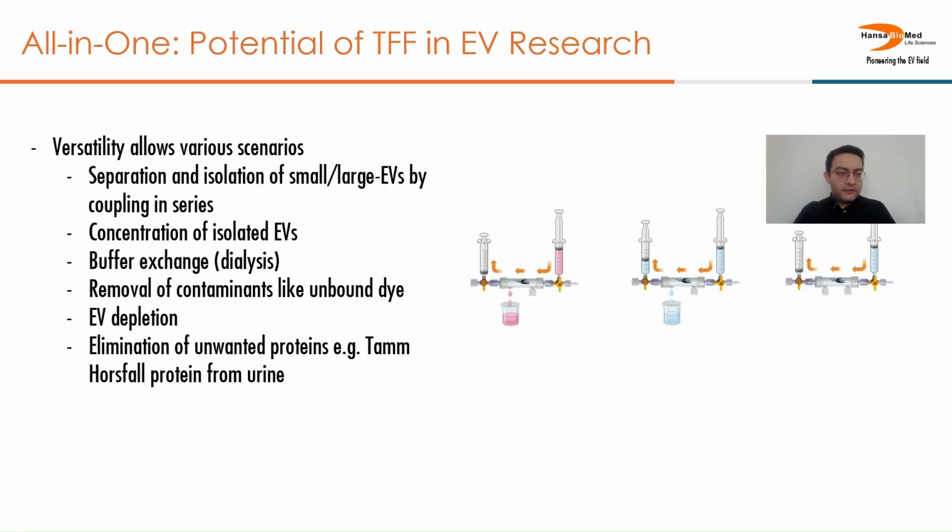But of course, the comparison is not only with the gold standard, because researchers have multiple isolation methods at their disposal. So you also need to provide some benefits compared to other methods. So one of the standalone advantages of TFF is its versatility, because the versatility allows it to be used in many different scenarios.